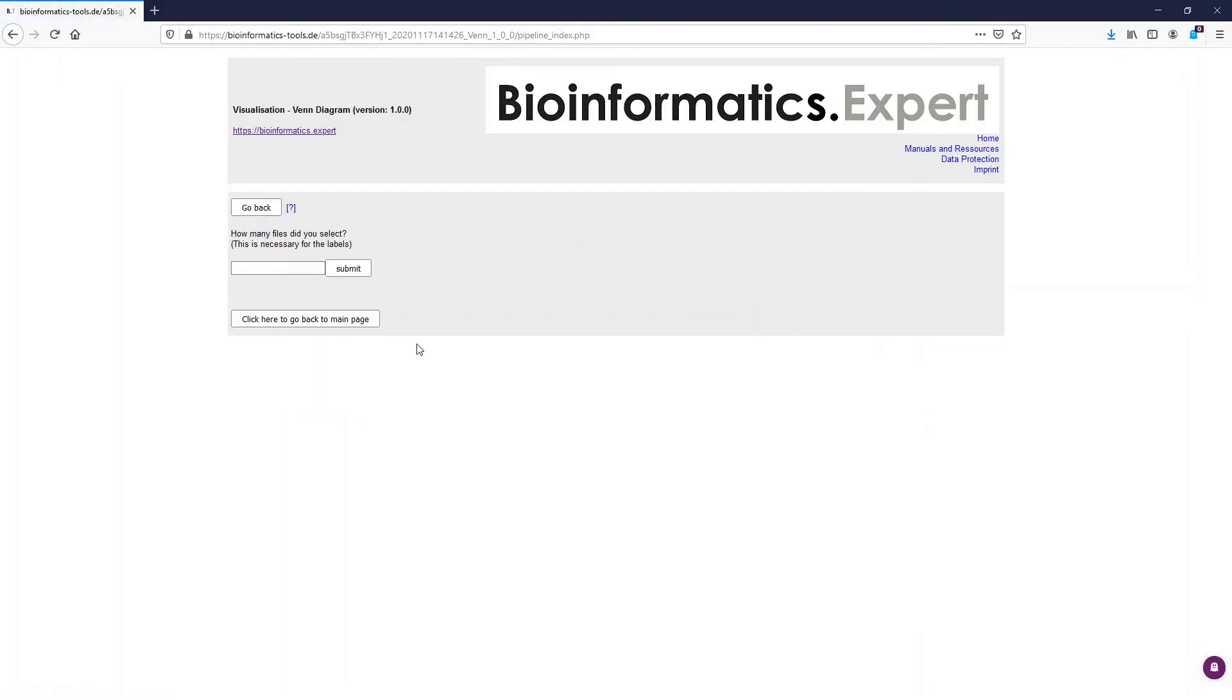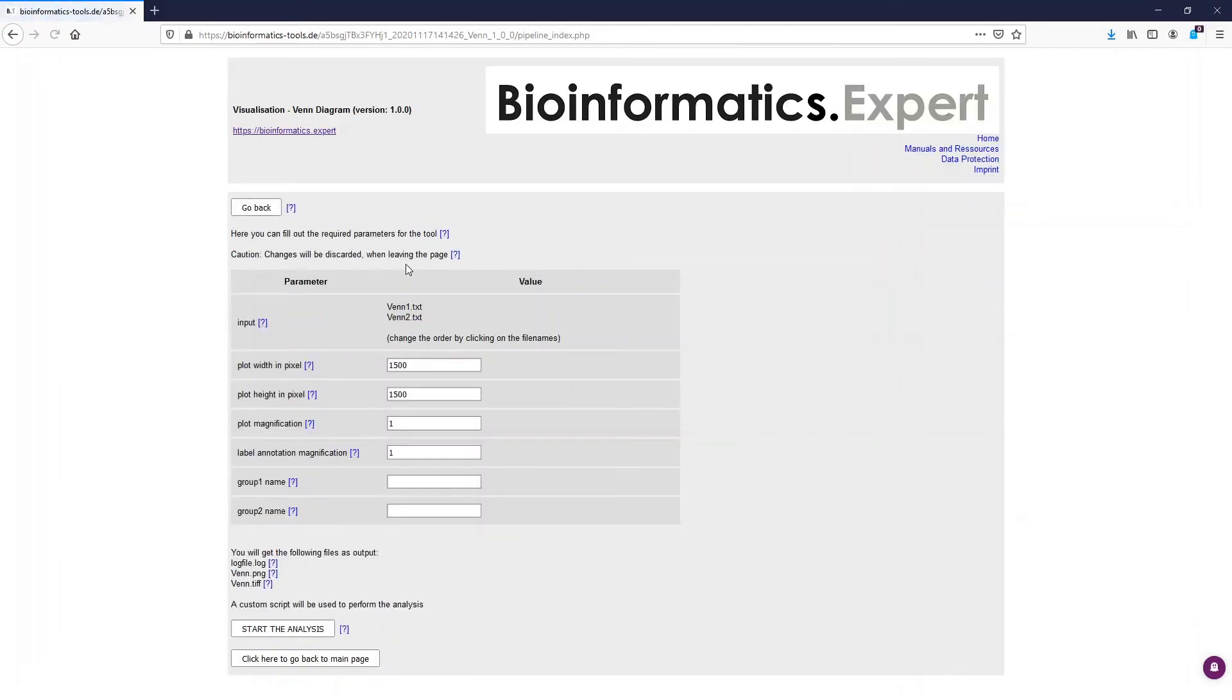Now the program asks you how many files we have selected because this is necessary for the labels. We put in two here and press submit, and after we press continue we see the parameter table.